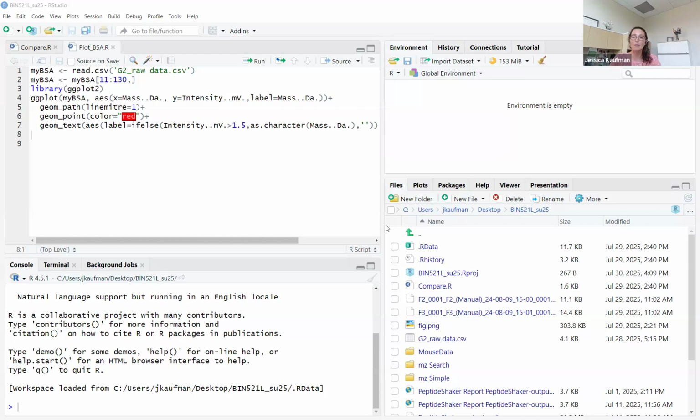And I gave you, as part of the lab report description, some example figures, and I thought it might be helpful to see what code I used to generate those figures and why I made those choices, and also give you some ideas of some other tools that you might want to use, some other packages, some other settings with your ggplot to be able to make something that looks even better for your lab report.